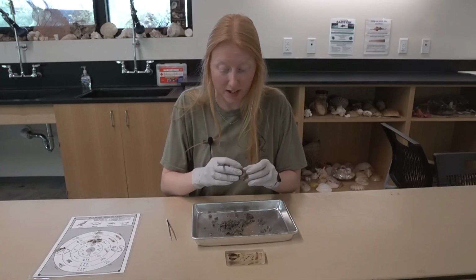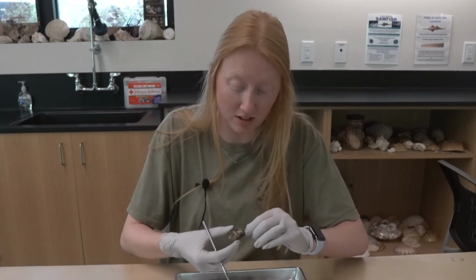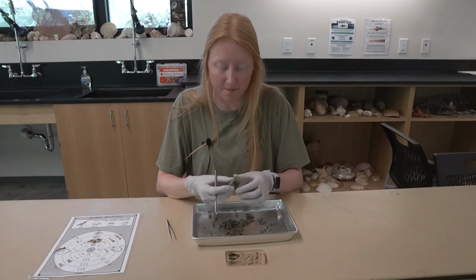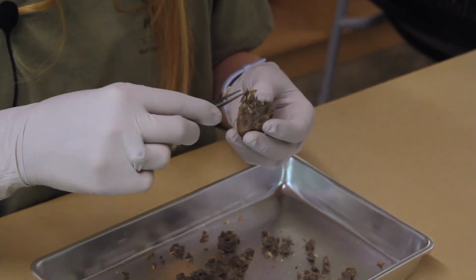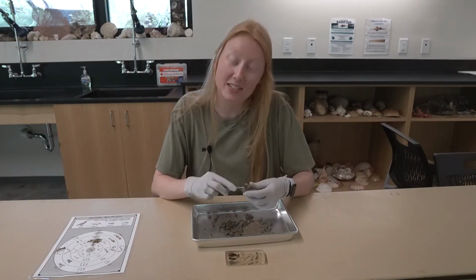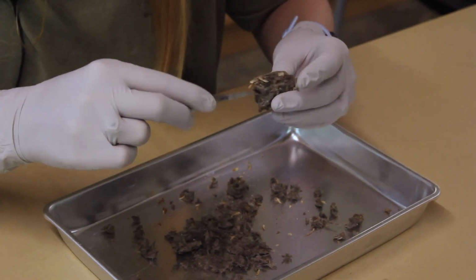It's starting to break a little bit just because it's been through digestive acids and all throughout an owl. So it's going to be very, very fragile, but again, just try your best to get it intact. If not, again, not a big deal. This was easier with a fresh owl pellet. It's been compacted and dried out for so long.